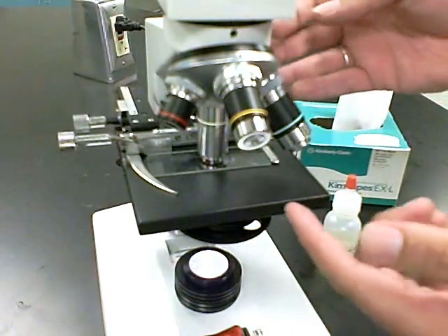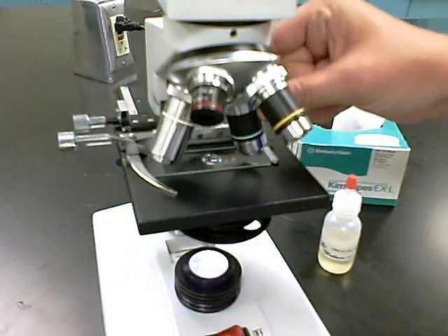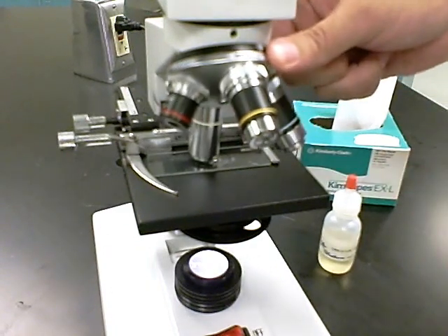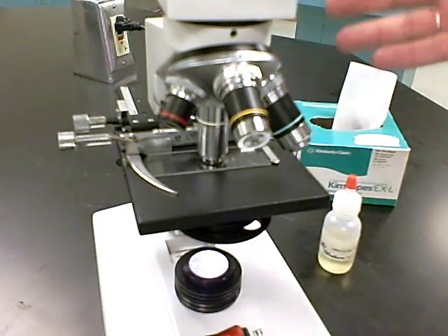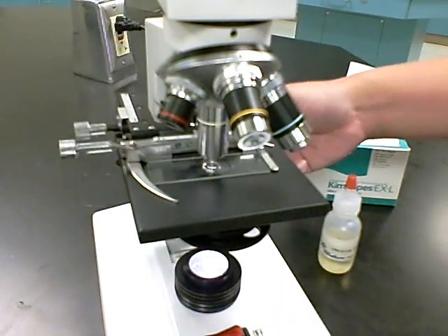Once you have gone to oil immersion, you've put oil on your slide, you cannot swing the 40x objective back into the oil. Only the 100x objective can be in the oil. So if you have a problem, you're going to have to take your slide off, clean the oil, and start again. Once you're finished with your 100x objective, you need to clean the oil off the lens.